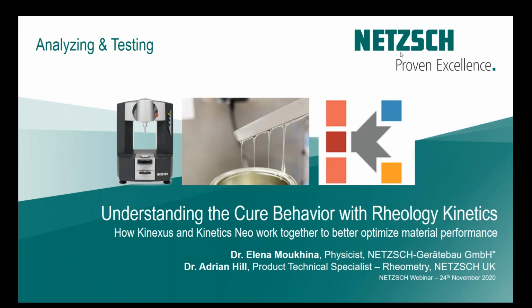But what we're going to do is slightly different, in that we're looking at how we can couple together practical rheology measurements to look at the curing kinetics, but then take it one big step forward, using this data and putting it into kinetic modeling software, our Kinetics Neo software, to understand in more detail, instead of just measuring under a few conditions, each of which takes time on a rheometer, as we'll see. The advantage of modeling software is that the limit tends to be your imagination. How do you want to set the conditions? You can model them, and with a few mouse clicks understand how the material will behave.